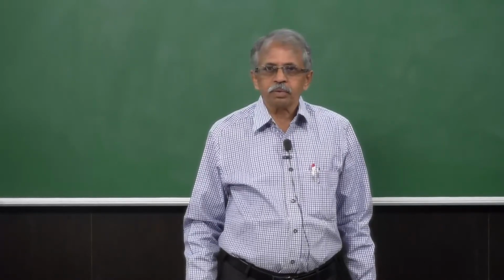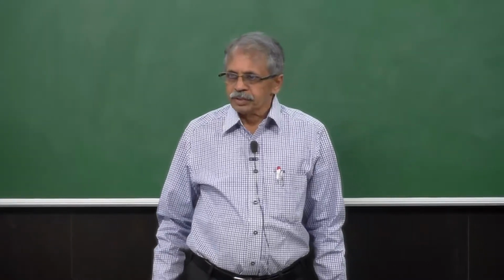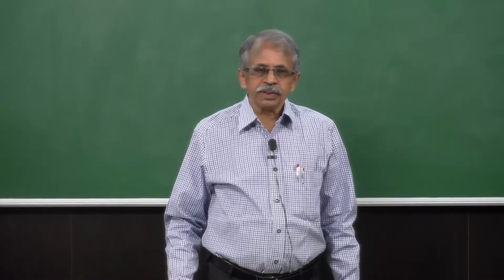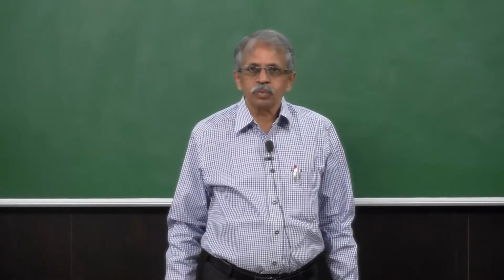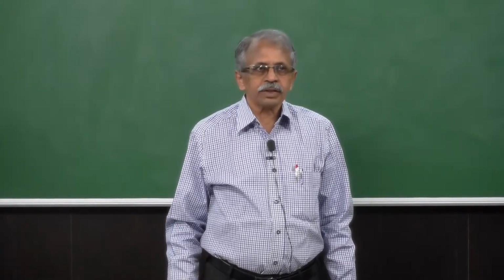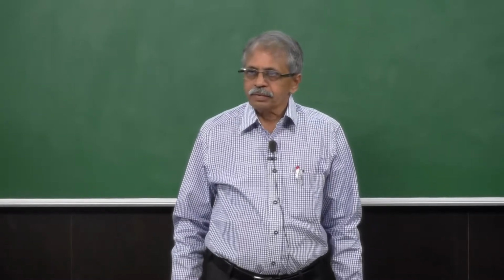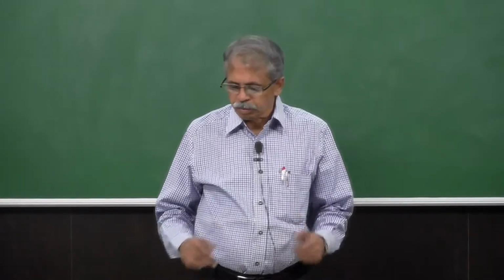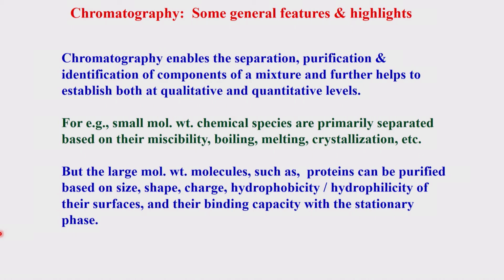Instead of talking about separation techniques in general, I take only the chromatography based techniques. Like I mentioned earlier, we will be using the instrumentation for different techniques, but you don't need to really understand the electronics and physics behind all these techniques. All that you require is to look at how such a configuration, how such an instrument works. Okay, so let us look at chromatography as a separation technique.